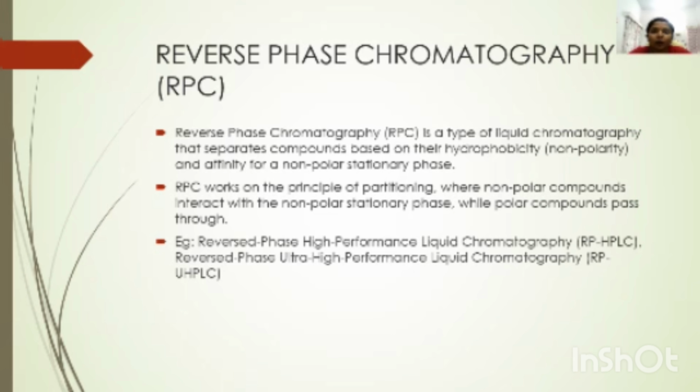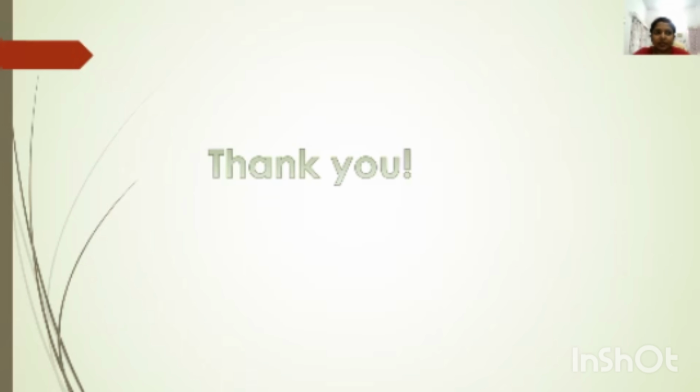So polar compounds will be eluted first and non-polar compounds will interact with the stationary phase. That's the basic understanding of chromatography, and we will see each type of chromatography technique in detail in the next slides. Thank you.